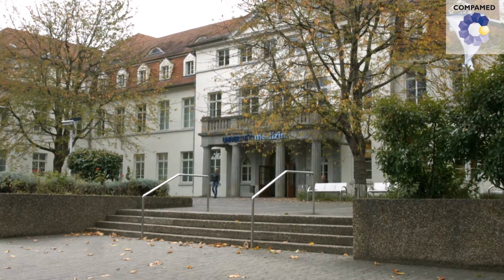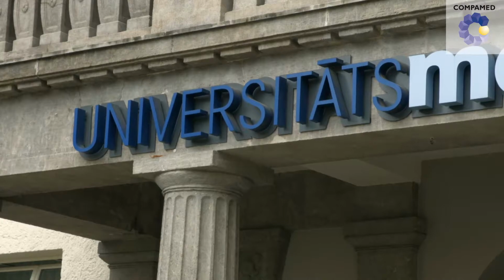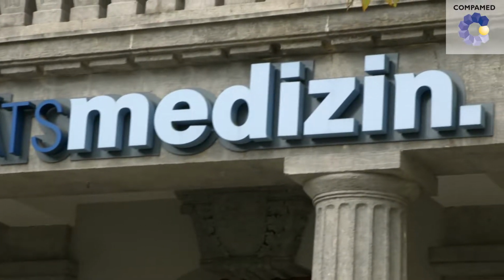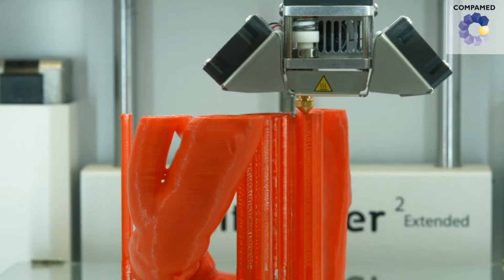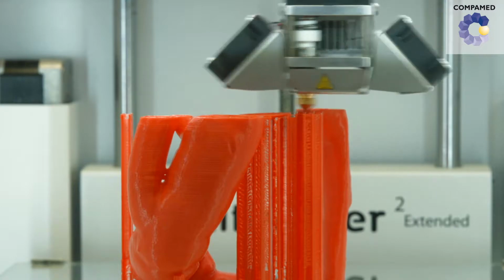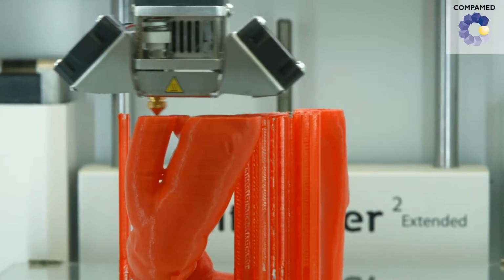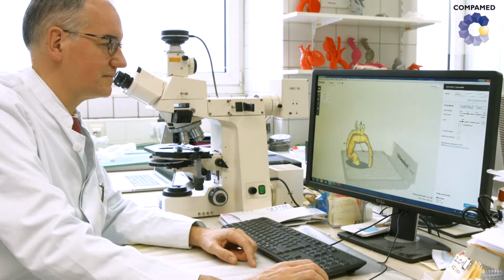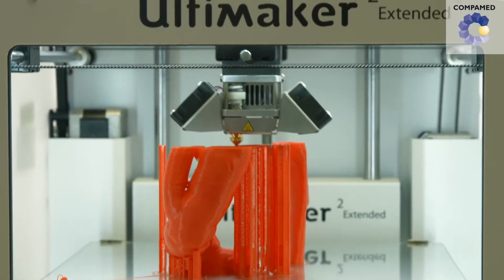BiomaTiCS is short for Biomaterials, Tissues and Cells in Science. This research program at the Mainz University Medical Center combines basic research science and materials science with clinical and surgical disciplines to translate the findings from materials science into clinical application. The 3 research areas of BiomaTiCS are translational nanomedicine, vascular integration of biomaterials, and 3D printing, with an emphasis on 2 areas of application.